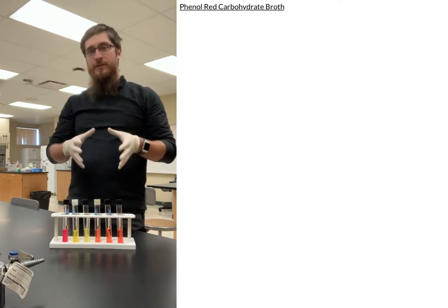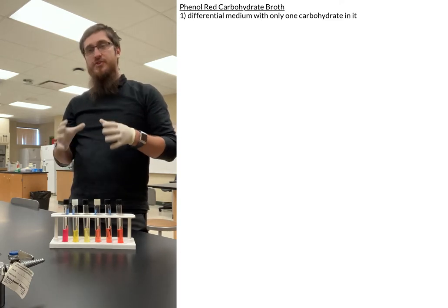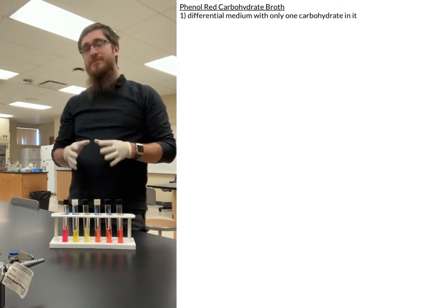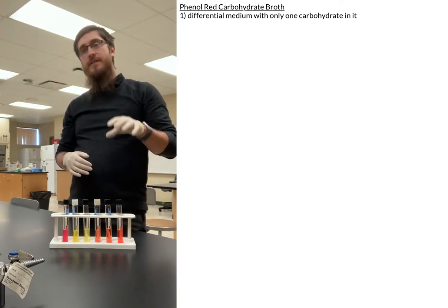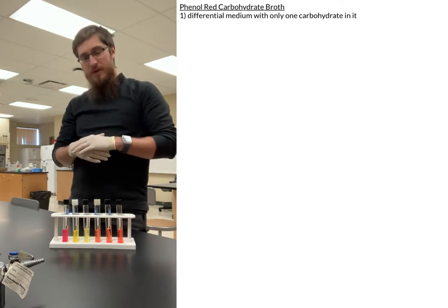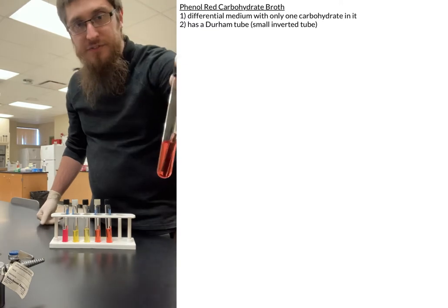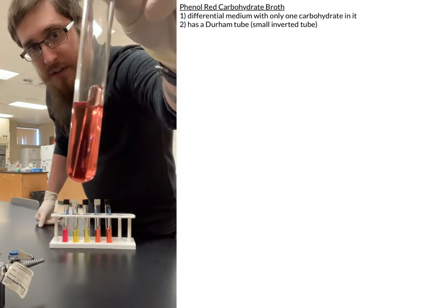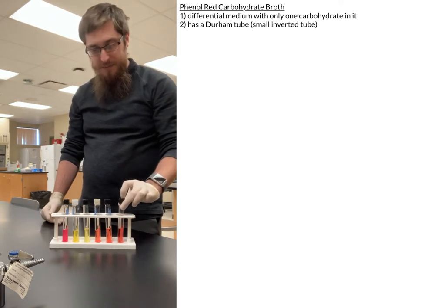Our phenyl red carbohydrate broth, or the PR broth, is a differential medium that is set up to have only one type of sugar or one type of carbohydrate within the medium itself. It also has a little inverted tube — what we call a Durham tube — and we'll talk about why that is important in a minute.